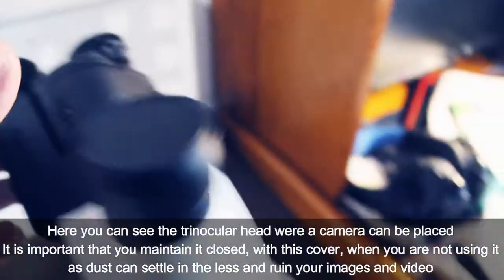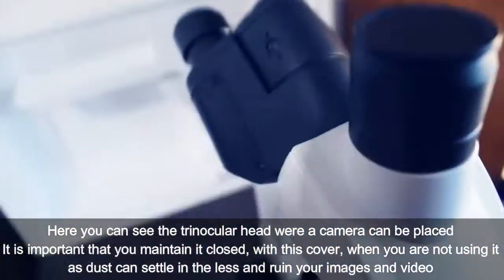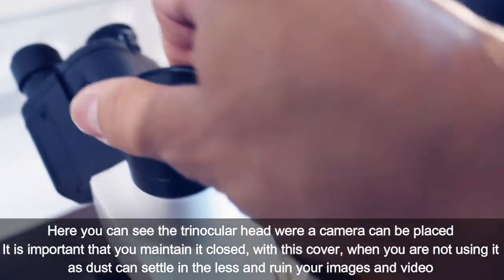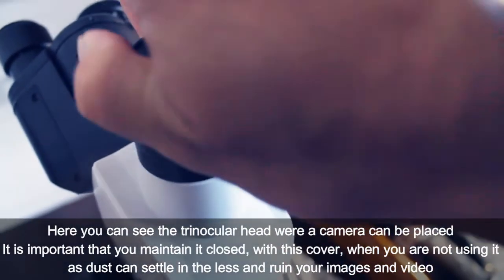Here you can see the trinocular head, where a camera can be placed. It is important that you keep it closed with this cover when you are not using it, as dust can settle in the lens, harming your images and videos.